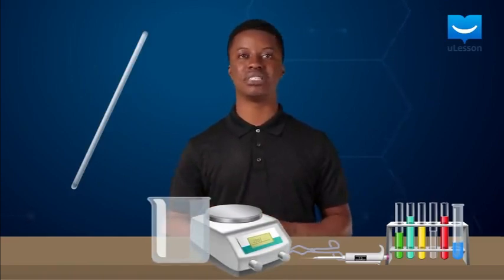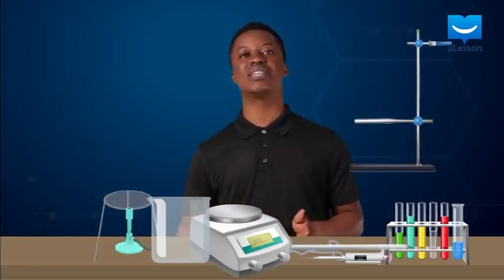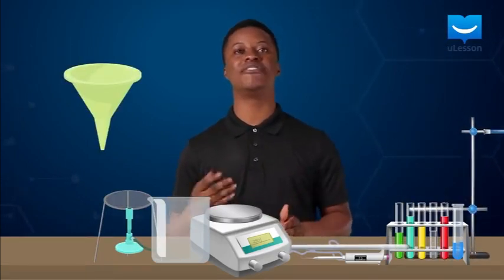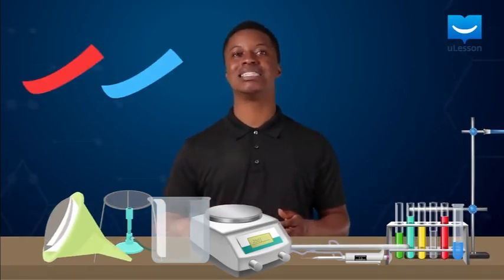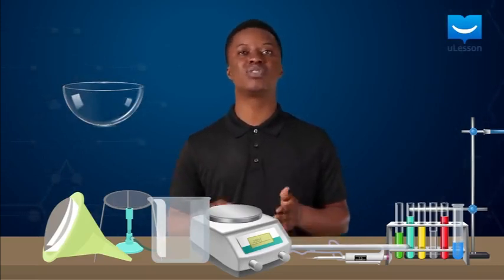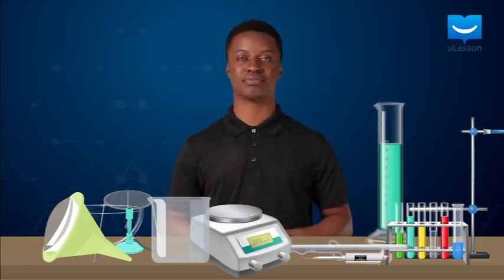rod for stirring, tripod stand and Bunsen burner for heat application, retort stand for holding glass apparatus in place, funnel and filter paper for filtration of insoluble solid and liquid mixtures, litmus paper for testing for acidity and alkalinity, evaporating dish for evaporating solvents in a sample, and measuring cylinders for measuring volumes of liquids.